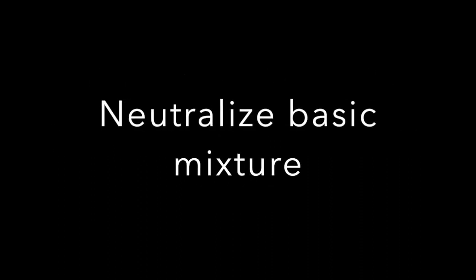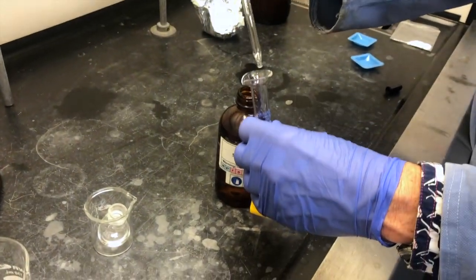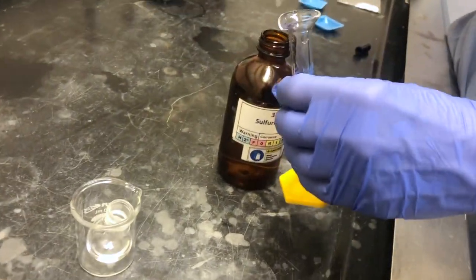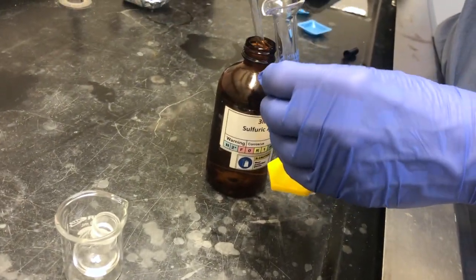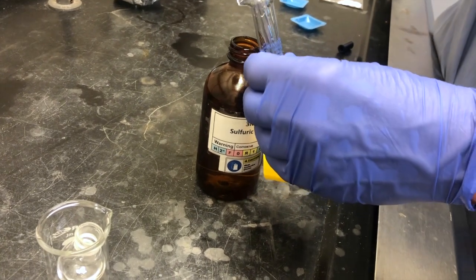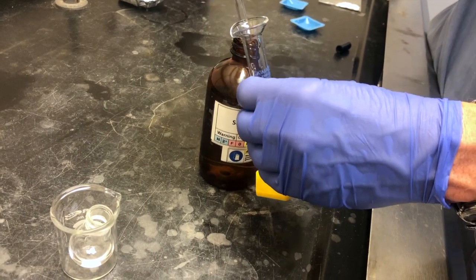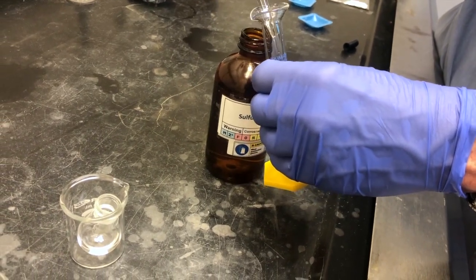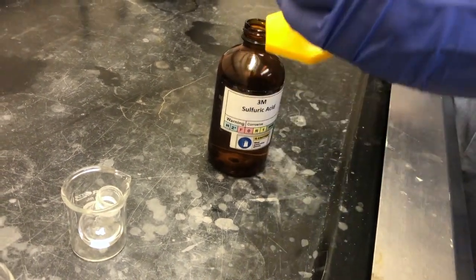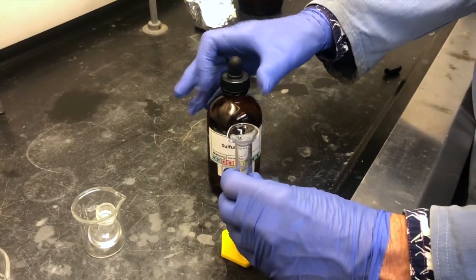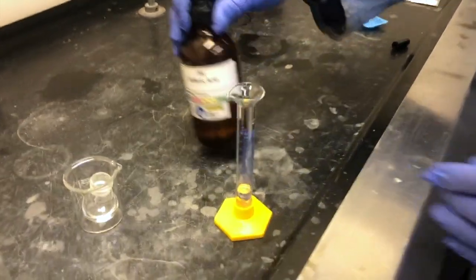At this point we were ready to neutralize this basic reaction mixture so three milliliters of sulfuric acid three molar were obtained. In order to keep track we placed this three molar sulfuric acid into a graduated cylinder but we ended up using all three milliliters.